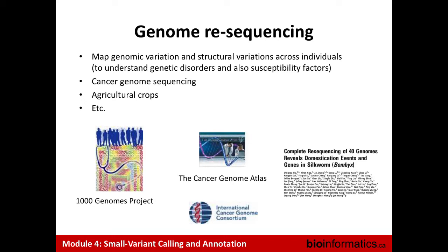It's also really important when we do cancer genomics. For example, we are part of a different consortium, called Profile, where we have some kids and young adults that are resistant to traditional cancer treatment. When we receive a sample, we have 2 weeks to find their variations, their somatic variations, and provide them to the clinician so they can adjust their therapy or try a new therapy. So it's really important to have good quality variant calling and to be confident in what we provide.